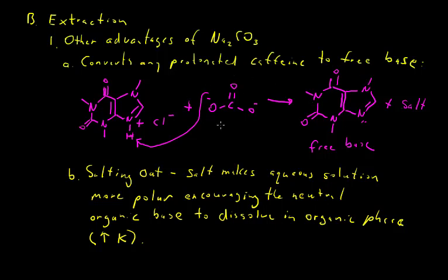It converts any protonated caffeine to the free base, greatly increasing the extraction, the partition coefficient, as you go from this to this. So this is much more soluble in the organic phase than this is.